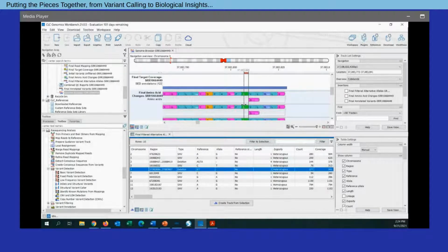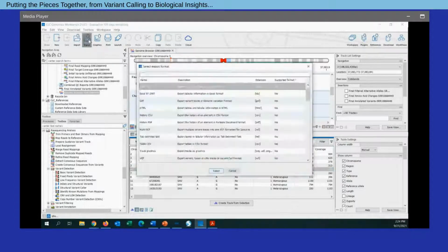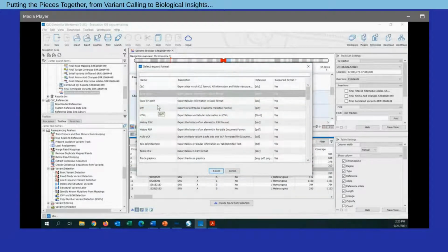So ultimately, within the workbench, through a couple of easy steps, I can import all my necessary reference information, my sample information, and very quickly run a workflow that accurately calls variants in my sample of interest. Now, at this point, I have the ability to export the data, and we can export this data in a number of different formats. We can export a table of variants or a VCF file. We can export PDFs for any variant level reports.